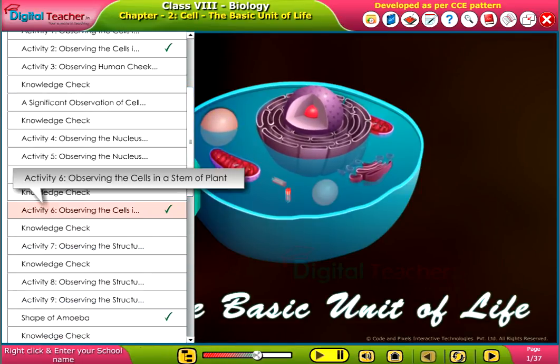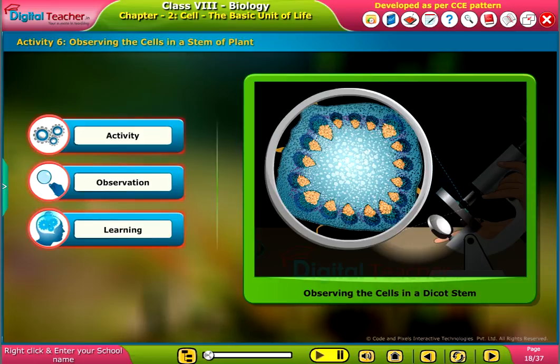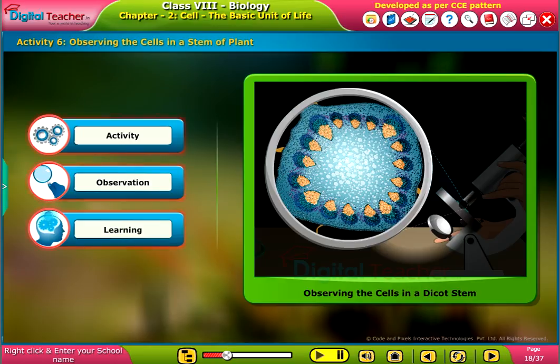Welcome to the chapter Cell. Here, let us perform an activity to observe cells in a dicot stem.